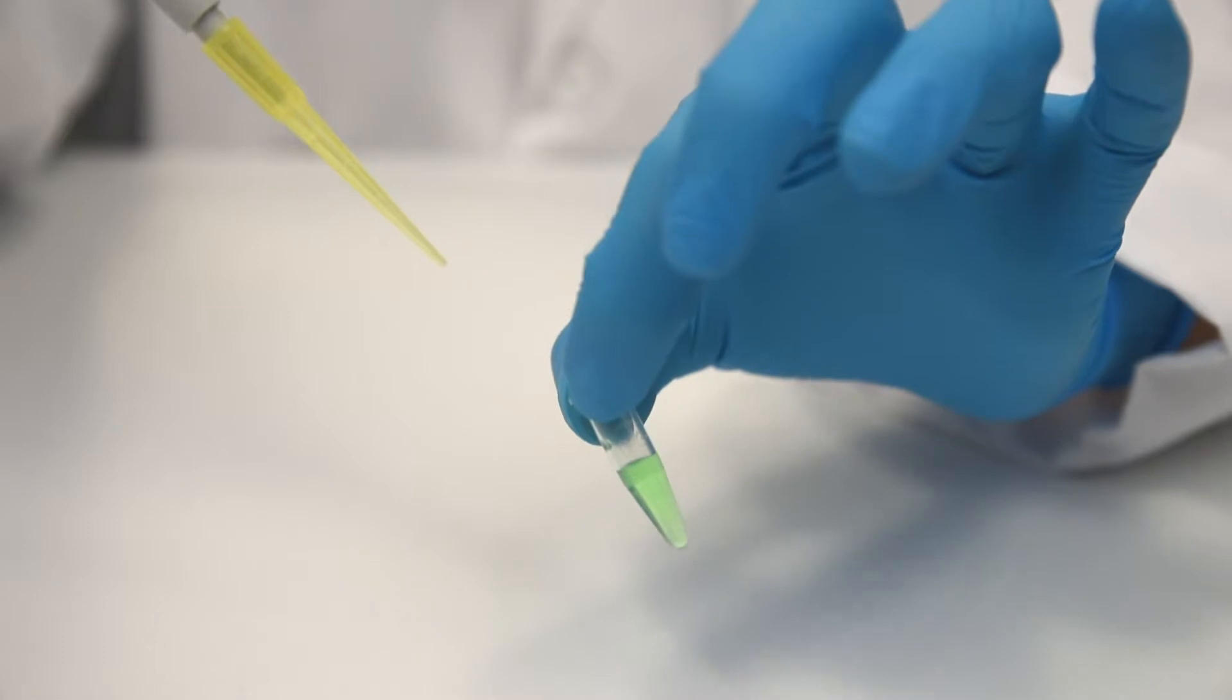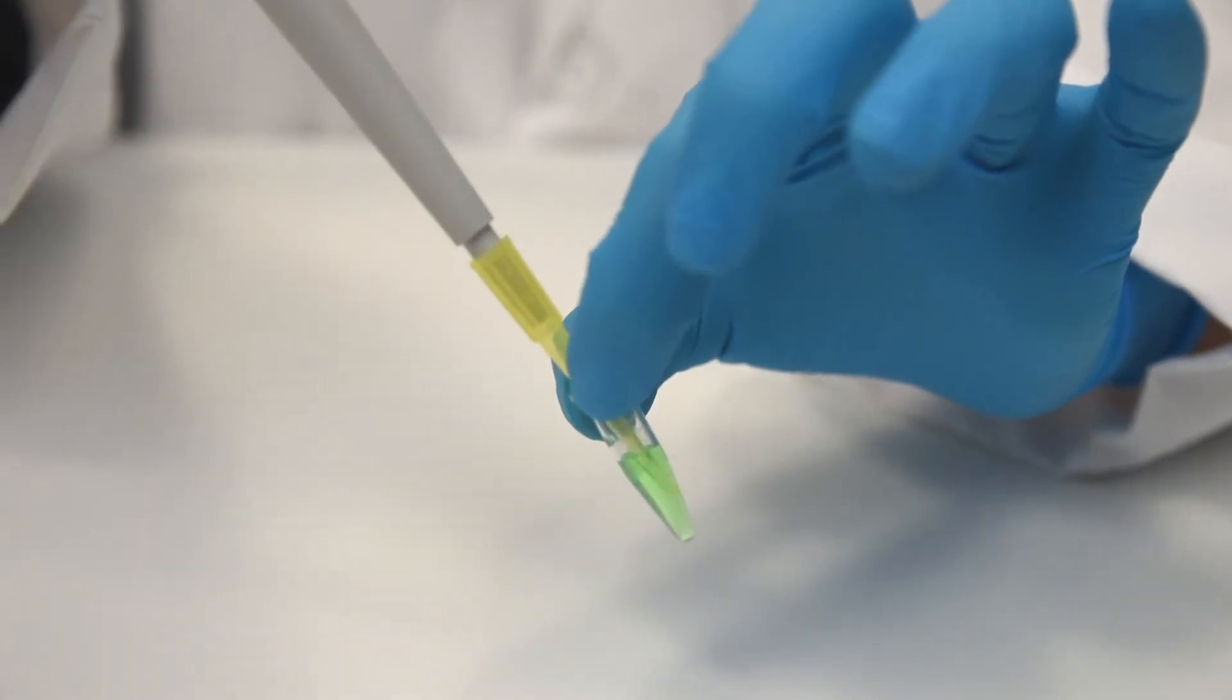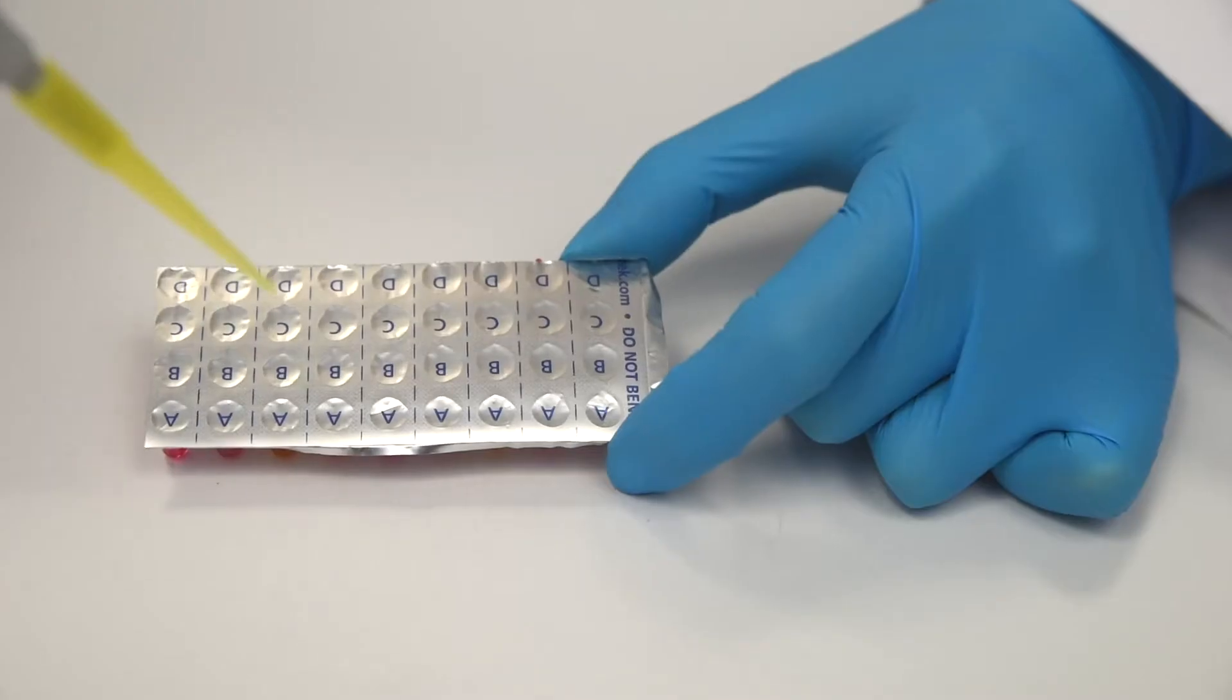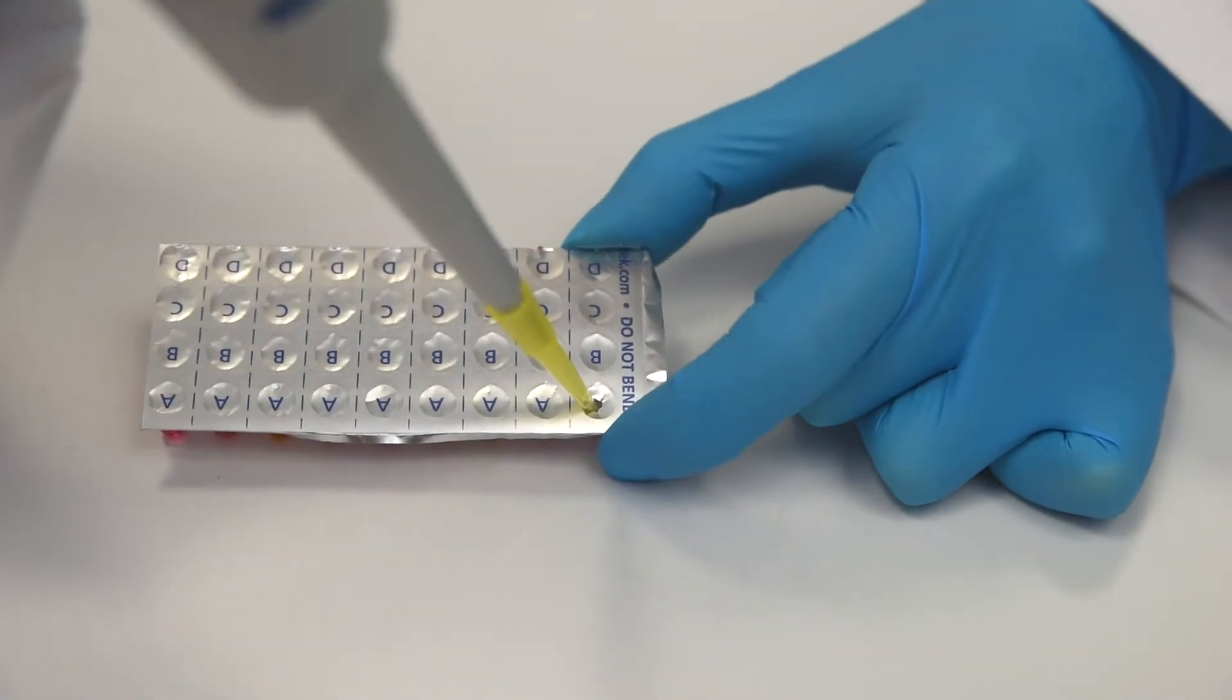Step 4. Using a fresh micropipette tip, add 5 microliters of control cDNA to the top left well of the quick strip plate by punching the tip through the foil.